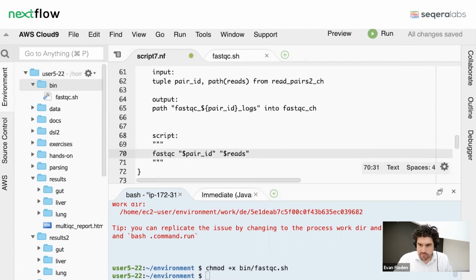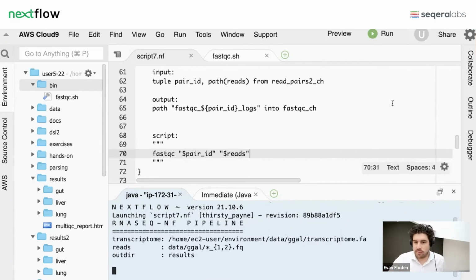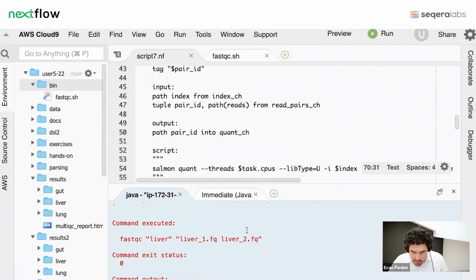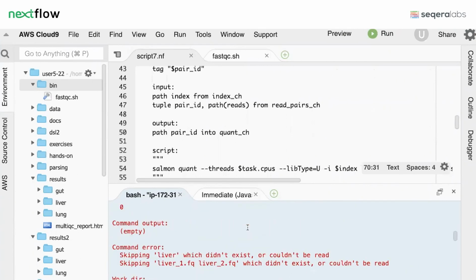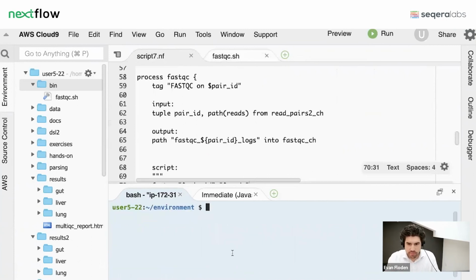We'll see another example later on where we run this, where we're going to be using much longer scripts. So if you start putting a large amount of Python in there, etc., you kind of run through and that will be through. Yeah, I think it's giving an error actually. In this case here, it looks like we're getting the error from Salmon itself. So I'm not sure exactly what the error is here. I can go back and see. We'll come back to that later on. Main point is that there's basically ways to externalize these scripts and when you run that through.